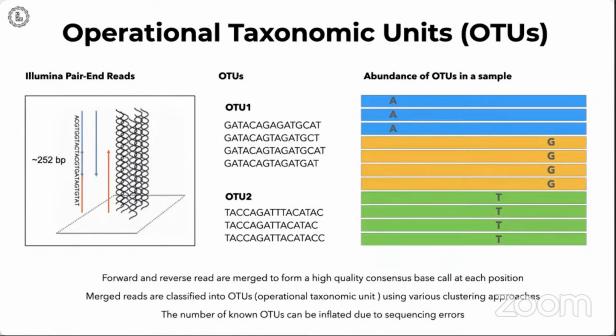Yes, Ramkumar, OTUs are no longer in use as we have ASVs, because ASV can be a general term that can take anywhere between 95% of the sequence identity to 99%. OTUs are restricted in the amount of identity that is used to define how two sequences are related to each other. That is why. Okay, it's not the case that it is not in use. It is still in use, but in order to have a very generic application of the sequence identity and their relationship to identifying key taxonomic ranks, we are referring to ASVs. Okay.